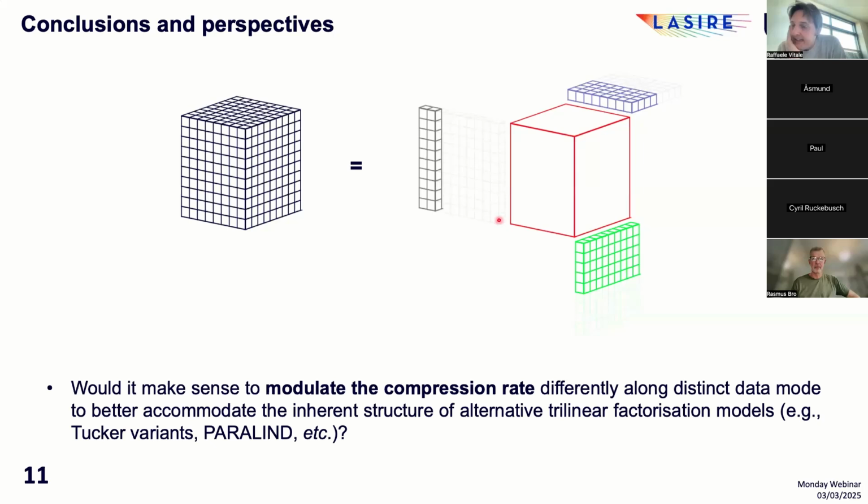The only thing that you will pay the price of is the number of essential spectral variables that you will select, because you will need to increase the number of components along which you perform the selection to catch all the sources of variabilities underlying your system.